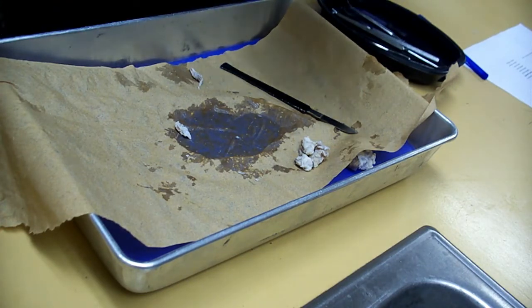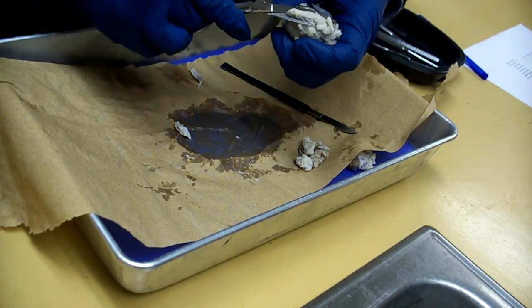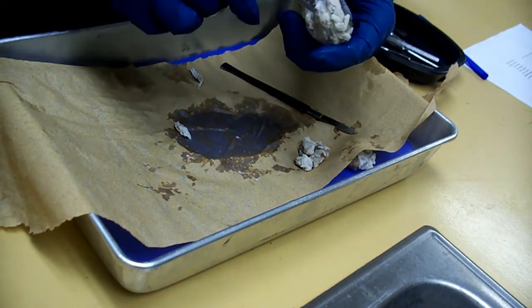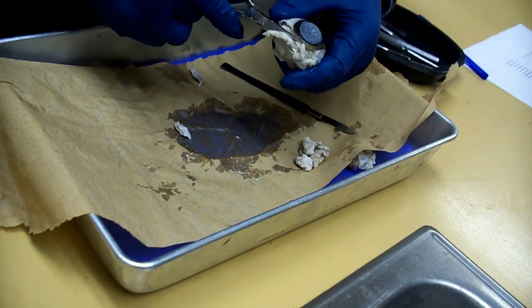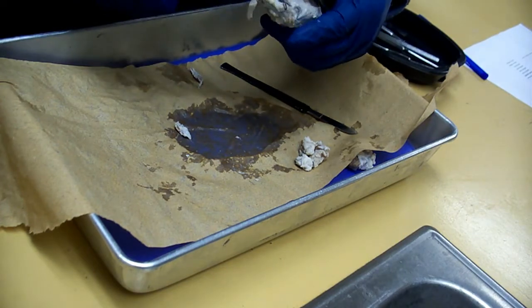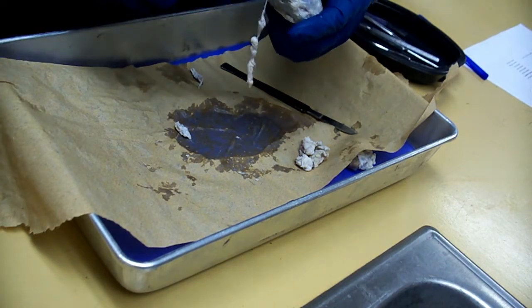Now remember, guys. When you put these black trays back, what do they have to be? They have to be dry, and the scissors and scalpel are very clean, so clean the fat off. Alright, guys. And use these towels that you have. Be very careful, we don't have too many towels.